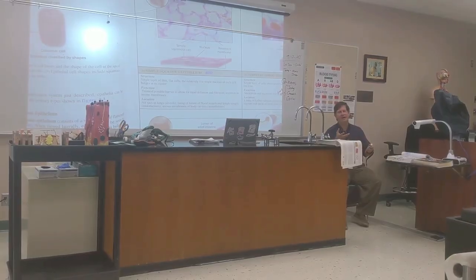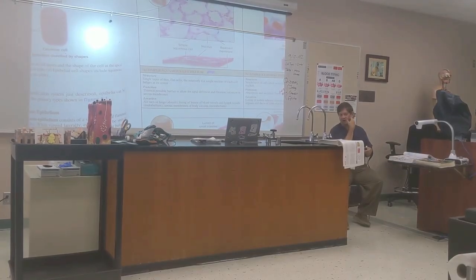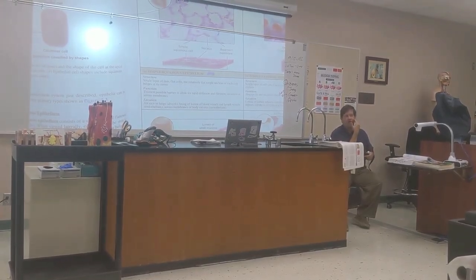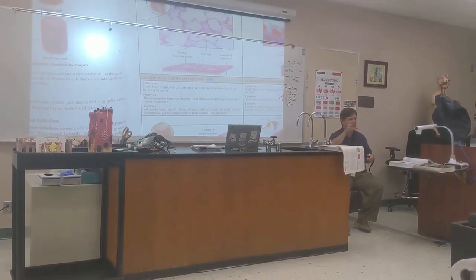So you're eating potato chips and you get a little scrape. Ah! Well, we don't want that. So we have layer after layer after layer after layer. Good. This is also stratified squamous. It's just that this is keratinized stratified squamous, so it's tougher than the non-keratinized inside your cheek. Are we good? Does it make sense?